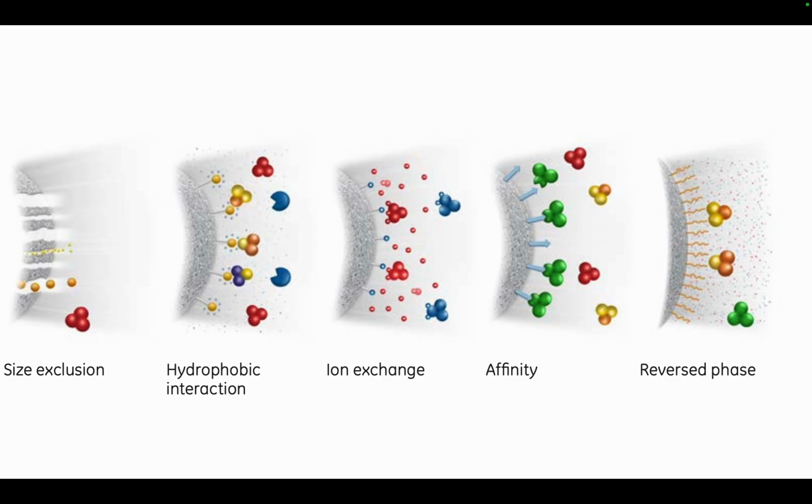So, as we've discussed in previous weeks, there are many different types of chromatography depending on which property of the protein you want to look at. One property that we discussed quite extensively was using the size of the protein in a process called size exclusion or gel filtration chromatography, where basically we have pores of varying sizes in the matrix, and because of that, different sized particles travel in a different way through the matrix, and thus we can separate them. But of course, there are many proteins which might have the same size also. So those can be separated in other ways.